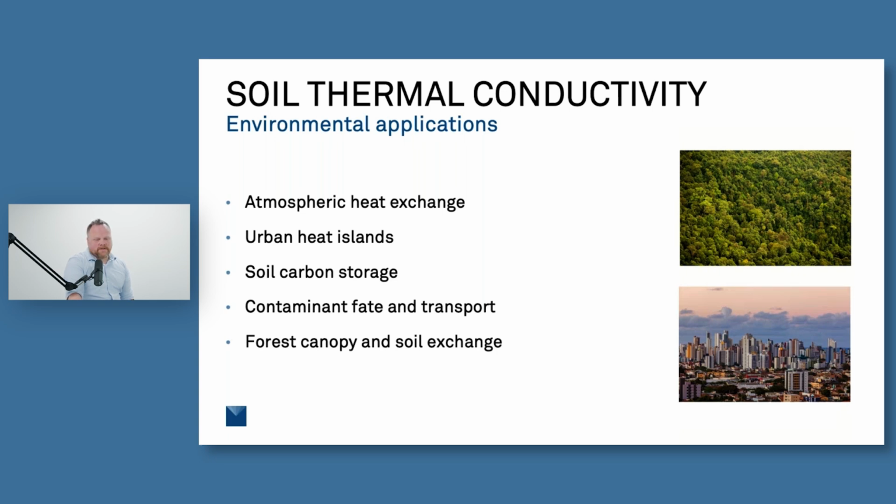Contaminants in the soil are also being affected by thermal conductivity as well. Movement of pollutants is influenced by the thermal conductivity, seeing how water moves through systems, seeing how that's affected by that. It can carry these pollutants and contaminants through the groundwater, and that thermal conductivity does influence how well that moves through there. We're also seeing a lot of remediation efforts, which we'll talk about here in a second, that are dependent on this thermal conductivity of the soil and other mediums that it's moving through.